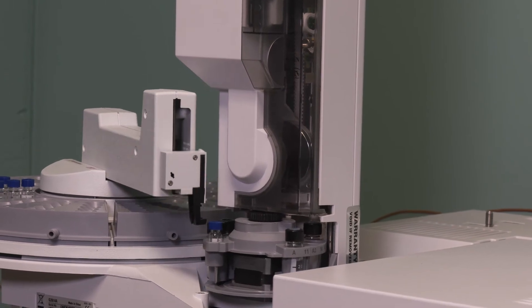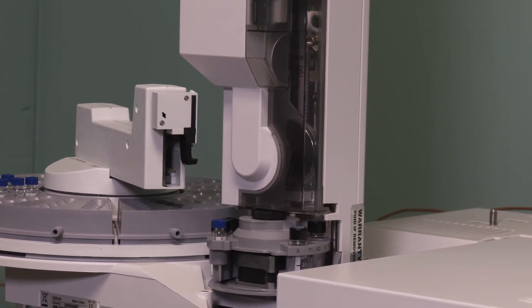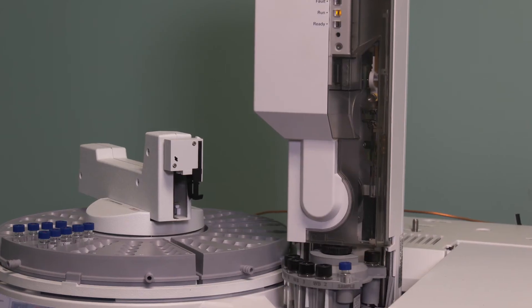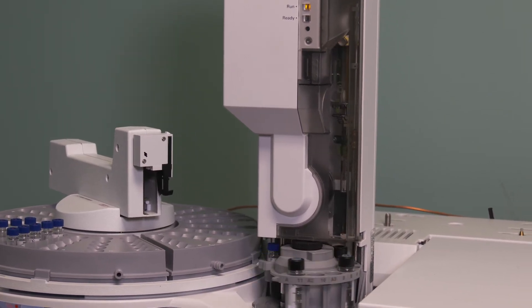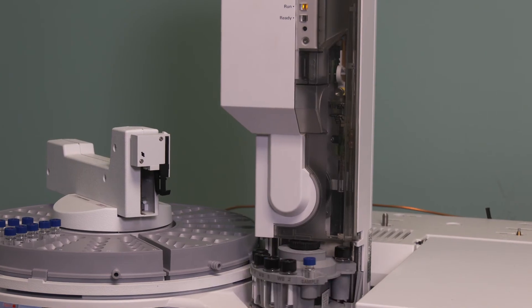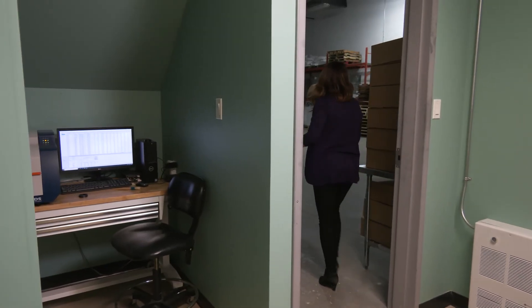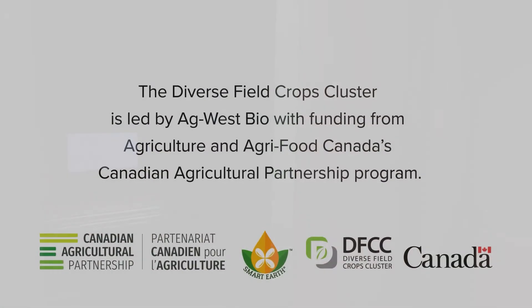We use this gas chromatography machine to analyze the complete fatty acid profile of our Camelina oil. This is a quality control measure that ensures that we are producing high-quality oil that contains the desired omega-3-6 ratio.